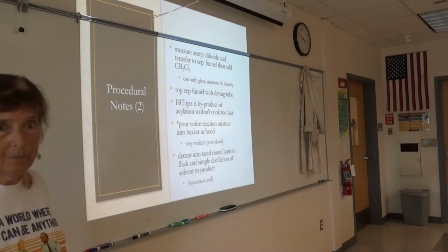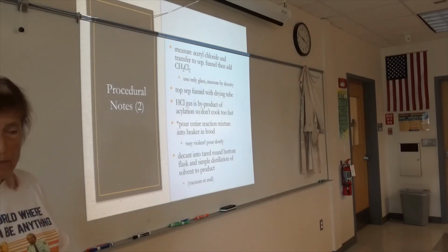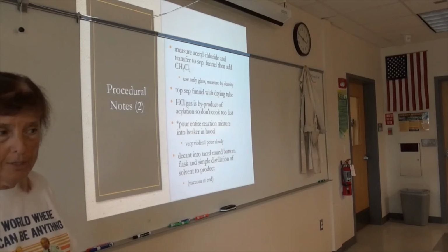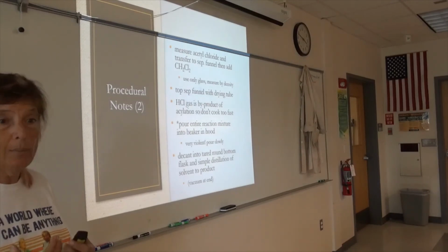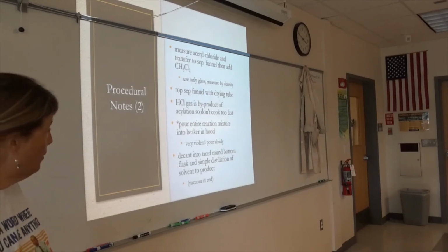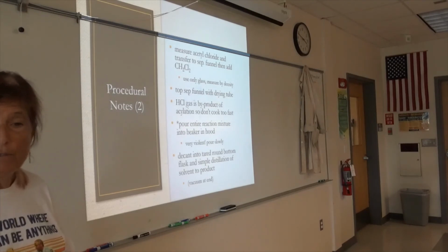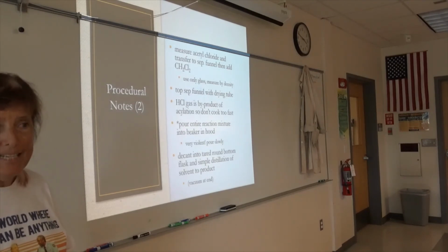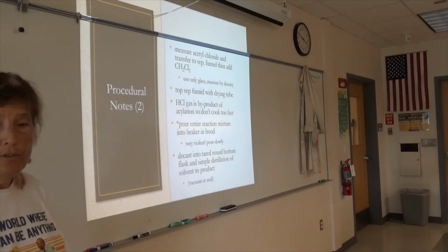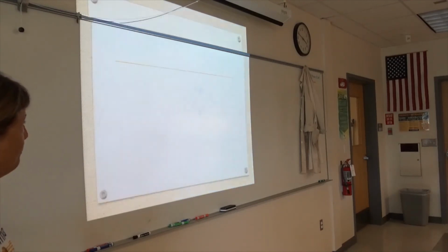You don't want to decompose your product, but you want to drive the dichloromethane over to the receiving flask. The receiving flask should probably be iced to promote condensation. You'll need to apply a vacuum from the house vacuum to the vacuum adapter at the end of that distillation to make sure that you've evaporated all the dichloromethane out of your source flask.